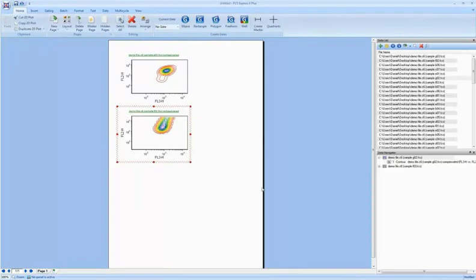Okay, so this is just a quick preview of how to use some of these features in FCS Express. Again, these are detailed in other webinars and in our documentation. So does anyone have any other questions about the import so far? My plan now is to show you a little bit of the high content and how the heat maps work, but I'll take questions right now and answer anything that you have outstanding before going on.